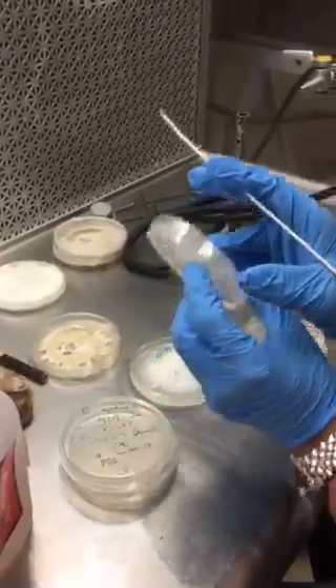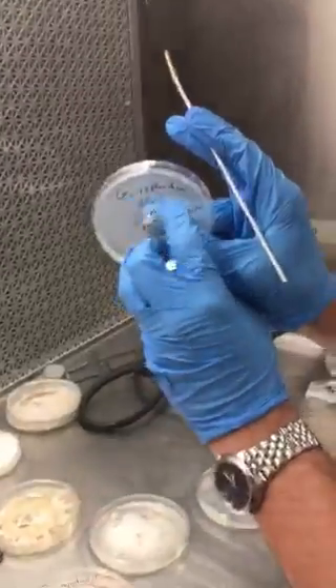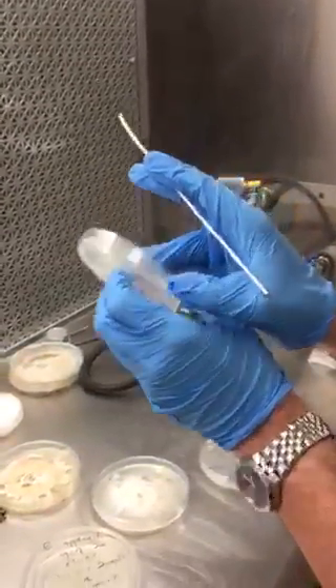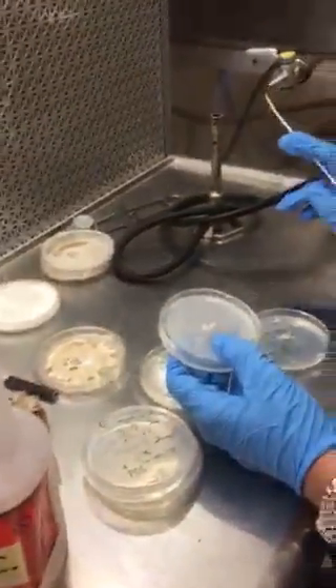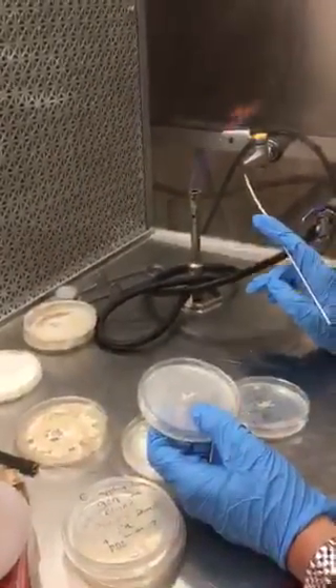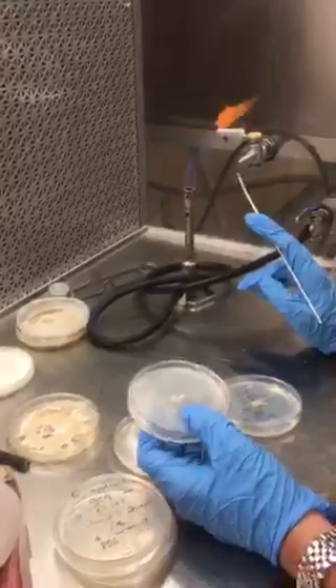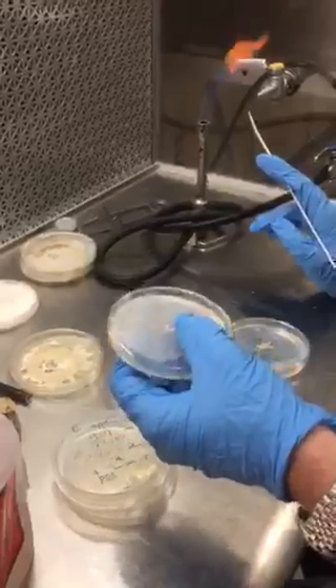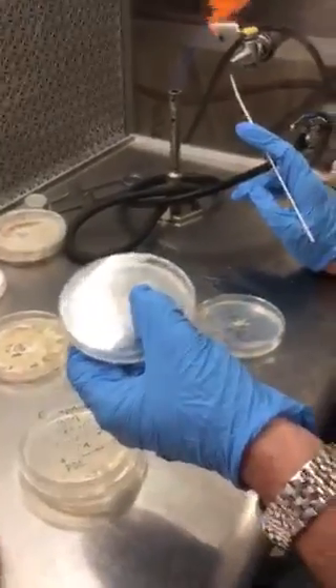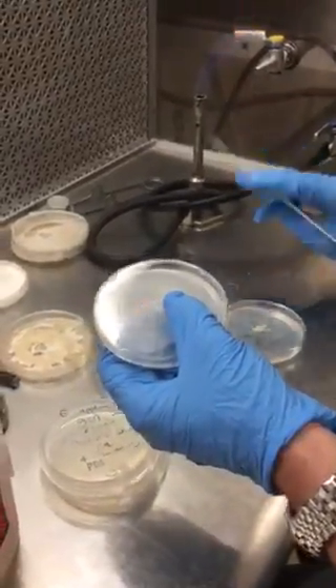In this case it's Ganoderma applinatum, which is the species. I'm just flaming the needle right here — it's the final step. After this we usually parafilm. You want to parafilm the petri dish. I'm going to show that in a second.